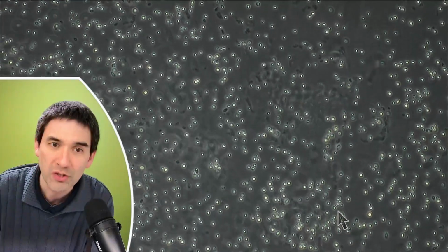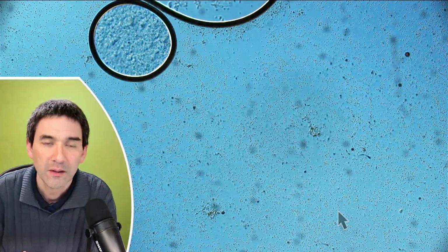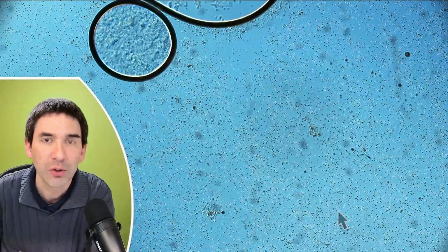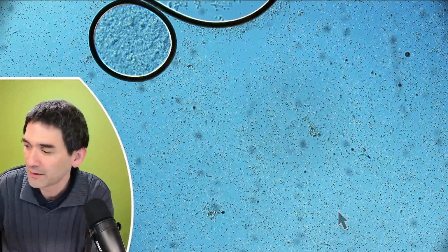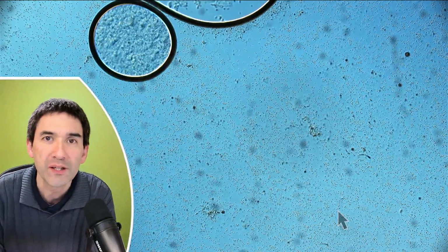So what I'm going to do is I'm just going to go down with the magnification a little bit to give you a better overview. You see the dots are now very small. And what I'm going to do now is I'm going to take a little bit of tissue paper, and I'm going to remove some of the liquid again.